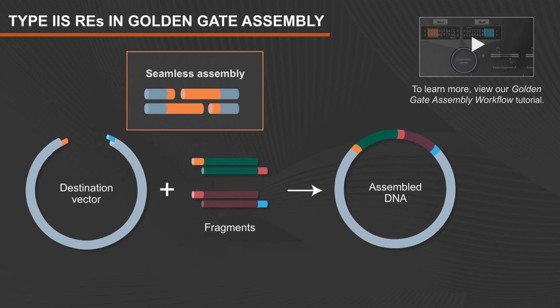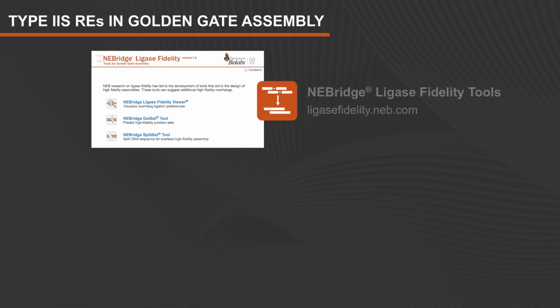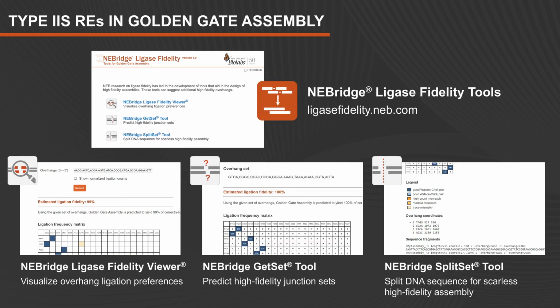fragments. New England Biolabs has focused research on the end-joining fidelity of these overhang sequences, leading to the development of ligase fidelity tools. These tools aid in the design of high-fidelity assemblies.